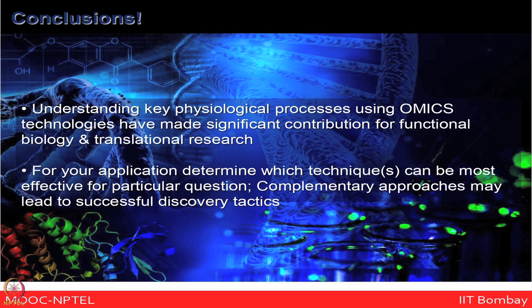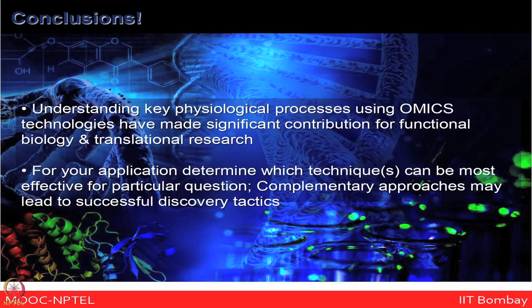You need to be very cautious and clear about which technology platforms you are going to use for addressing a biological question. All of these proteomic technologies have made a huge revolution in understanding various biological systems, but depending on your need, you can choose sometimes a gel-based proteomic technology or directly mass spectrometry, or use microarrays or SPR or many other technologies available to address the right biological question.